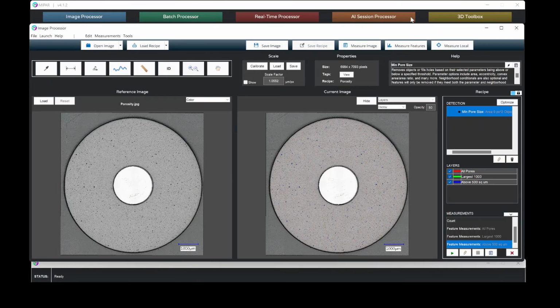All these measurements are also available in 3D. A batch analysis can be performed on all the 2D micro-CT slices to quantify the entire porosity of a ceramic part. This way, manufacturers can now leverage the power of MIPAR to detect defects before their customers do and improve their material process.